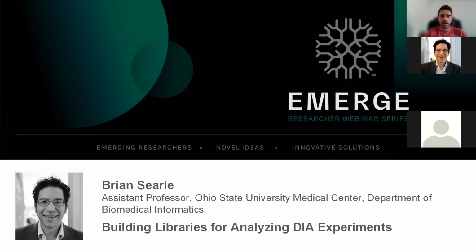And of course, building libraries and extracting the data is a critical part of the DIA workflow. And this is what Brian is going to be focusing on.